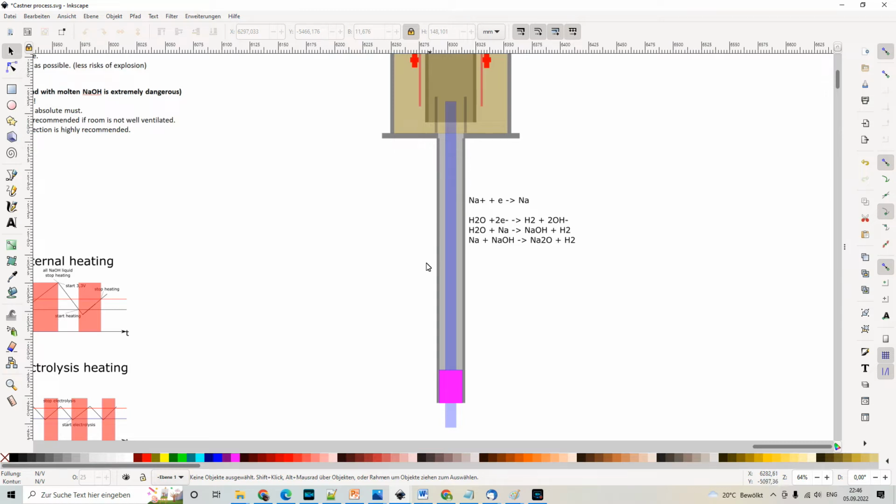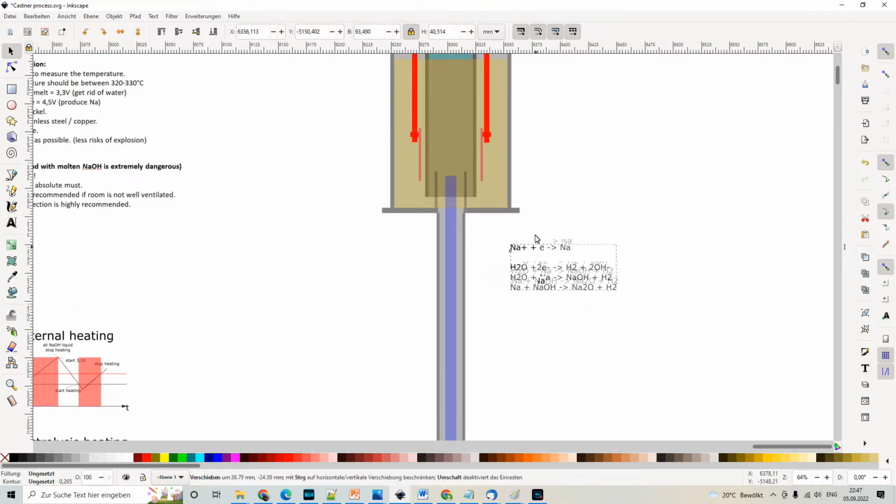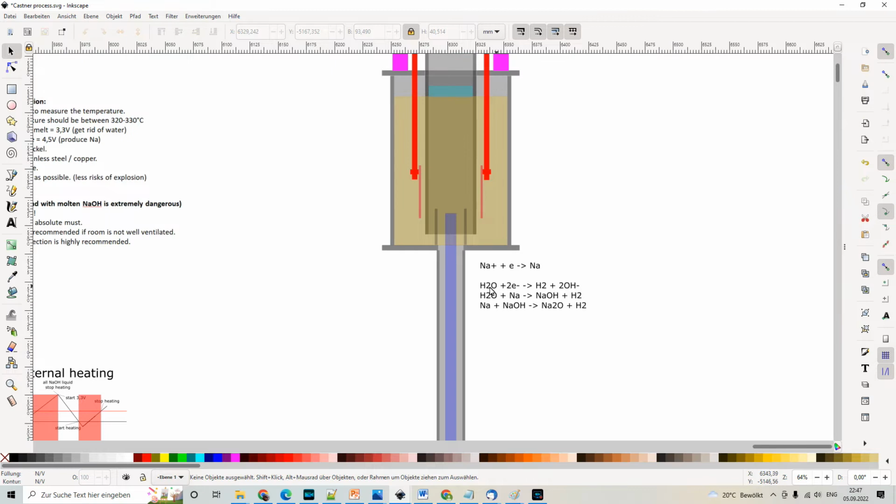So this is a very cool thing and a very good idea that Castner had here, and it works really fine. Yeah. So coming to the chemical reactions on the cathode. The main reaction that we want is that the sodium ions are getting reduced to metallic sodium. But apparently we are also having some other side reactions that we do not particularly want, but they are actually happening.